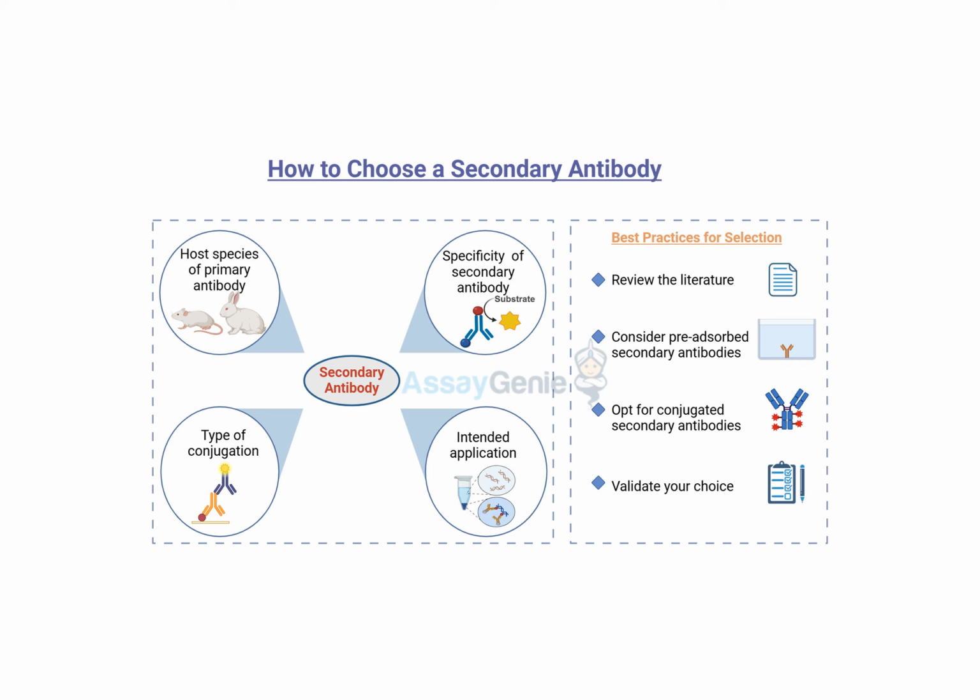And that's where the secondary antibody comes in. The secondary antibody binds to that primary antibody, and it carries a signal, basically a beacon. So that could be a fluorescent molecule that lights up under a microscope, for example, or an enzyme that creates a visible color change. These are what we call detection methods. Okay, so there's multiple ways to actually see what's going on at that tiny level.